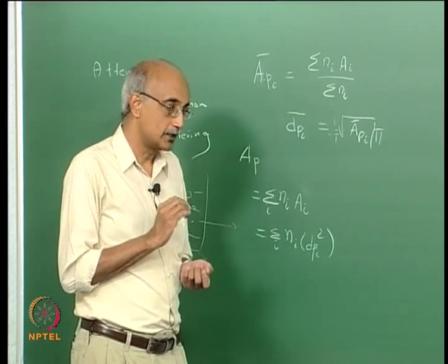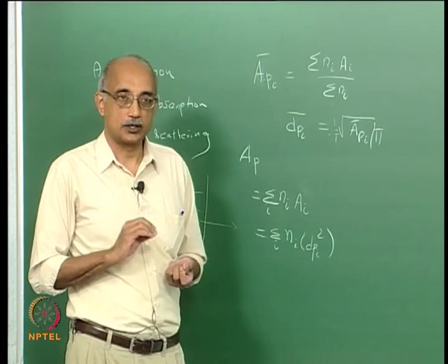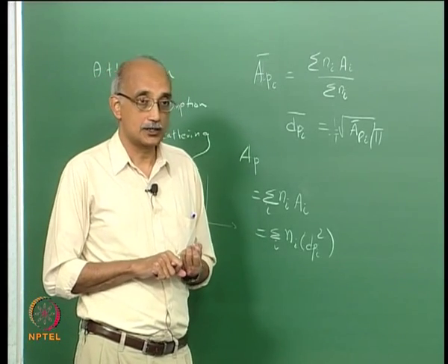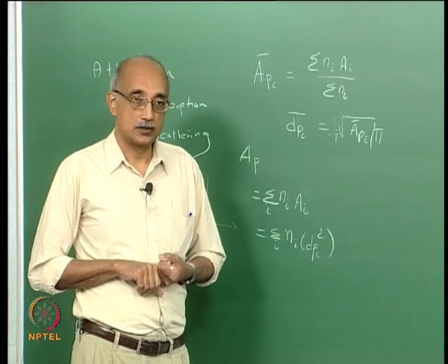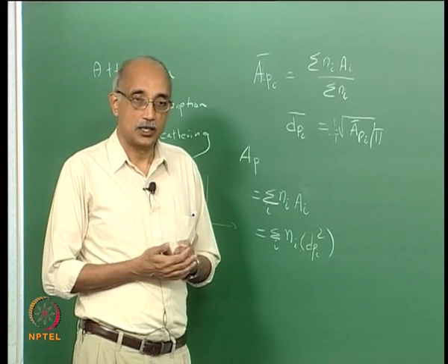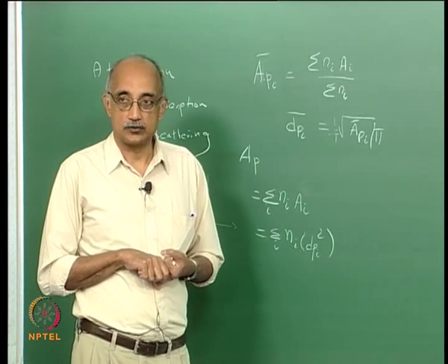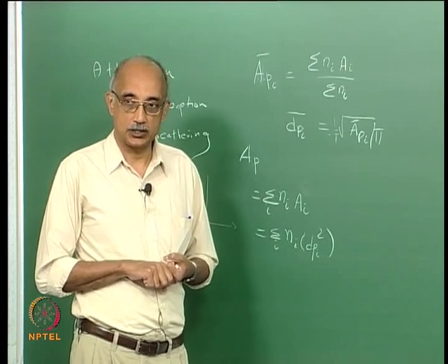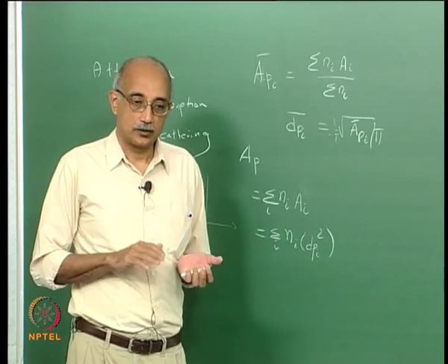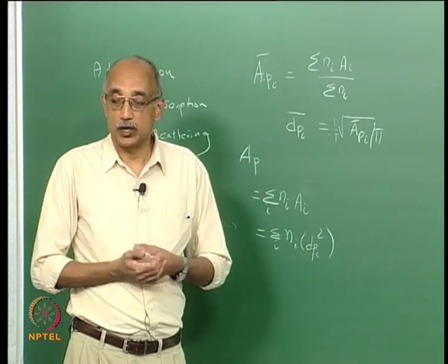If all you care about is the mean size of a particular population, then first try dynamic techniques, secondly try static techniques that primarily involve visual inspection. If neither one works as an option for your specific application, then you use scattering techniques that are effective for an entire population of particles.